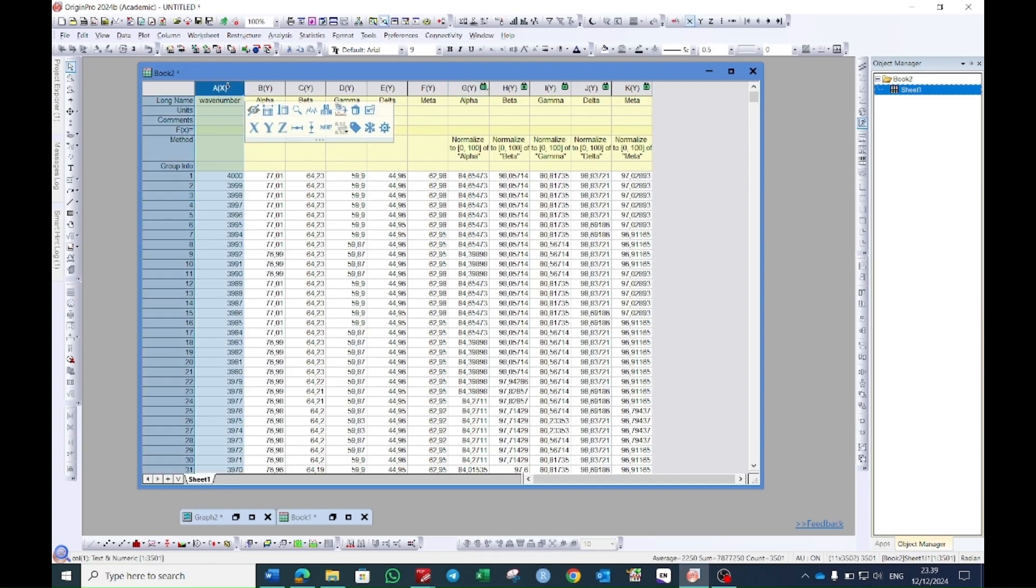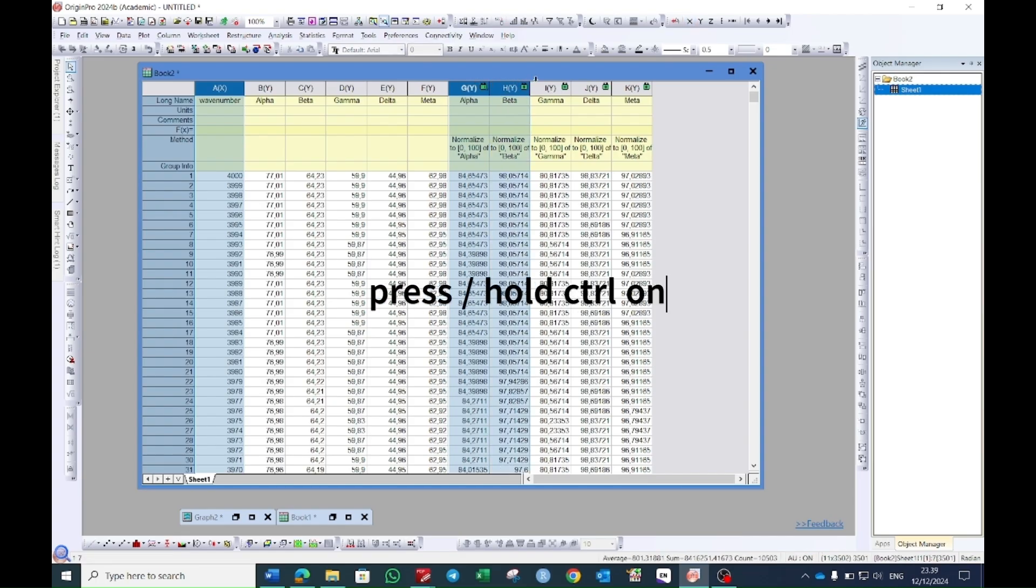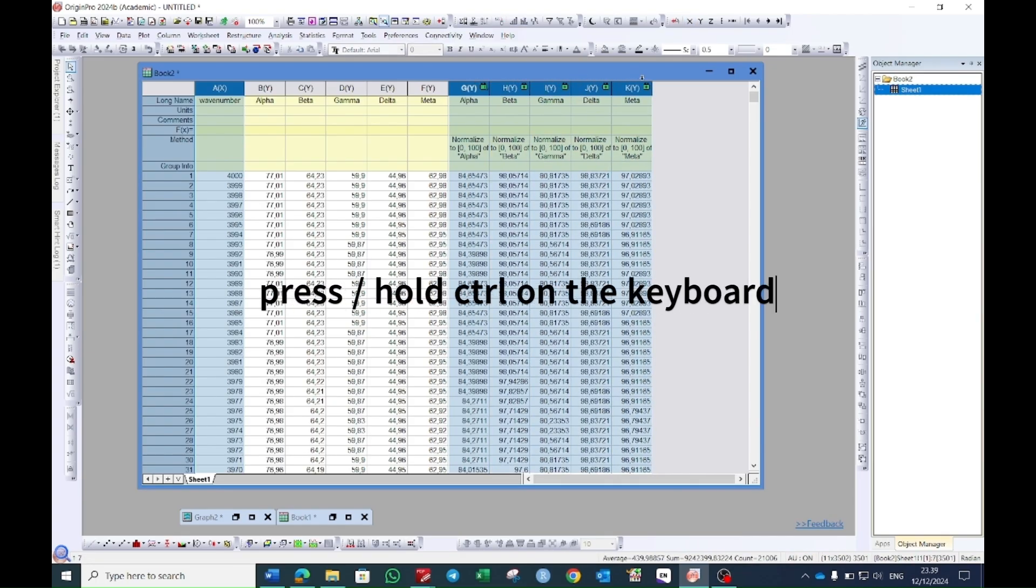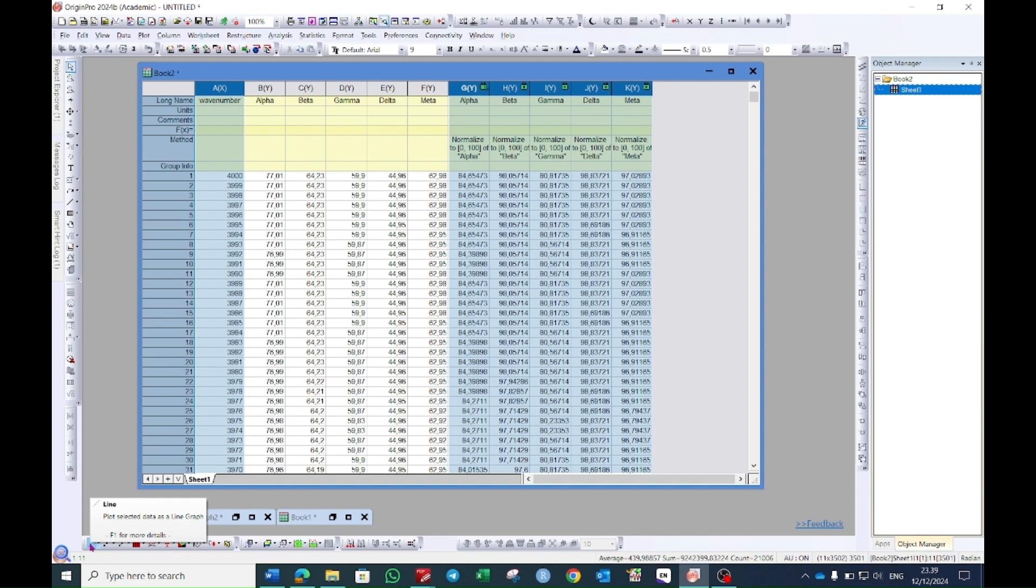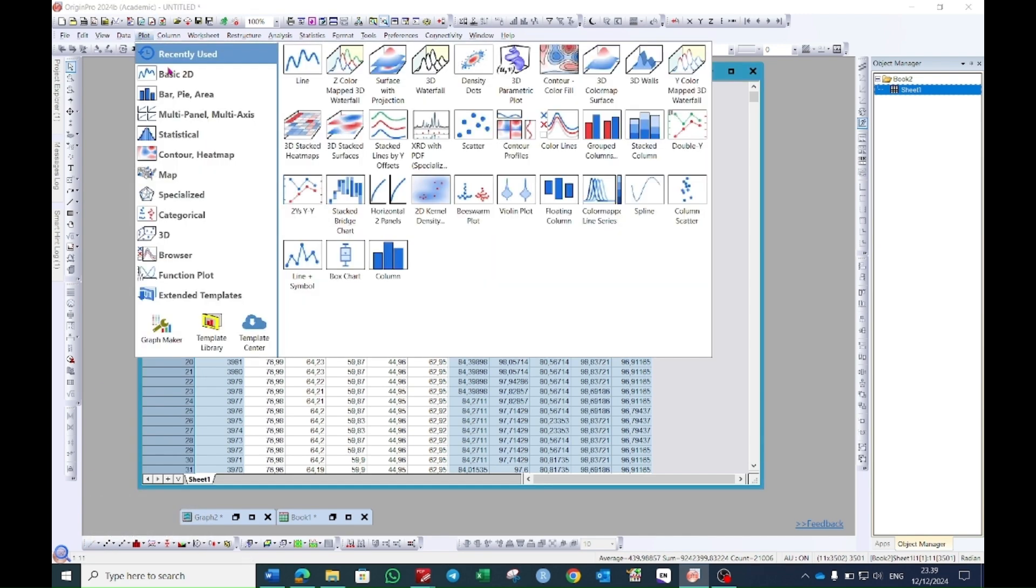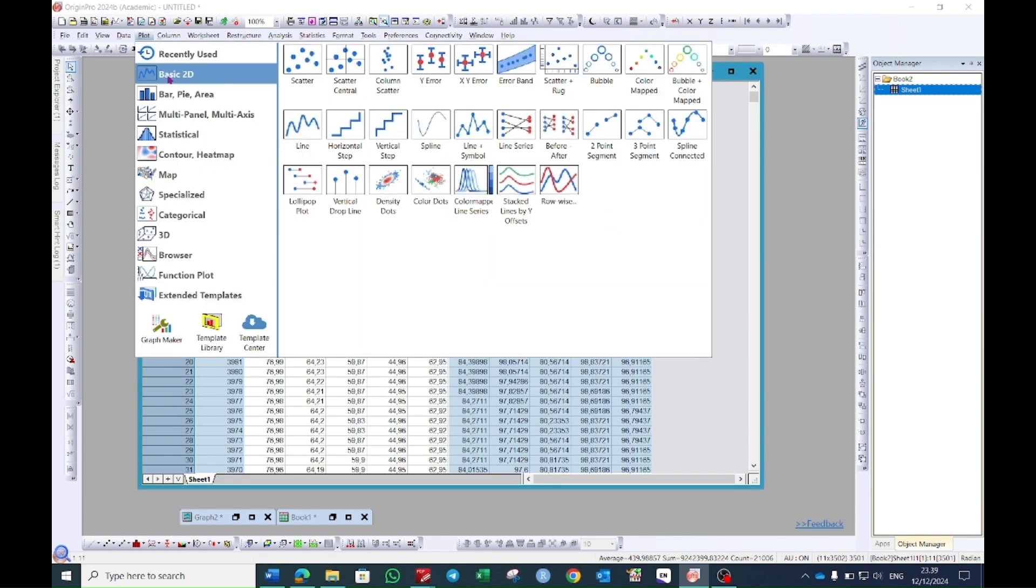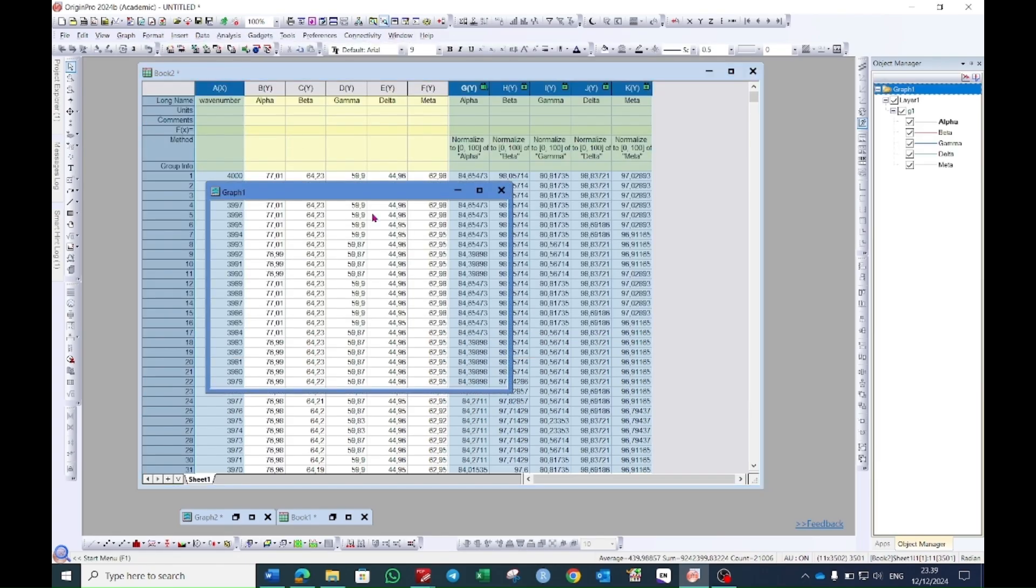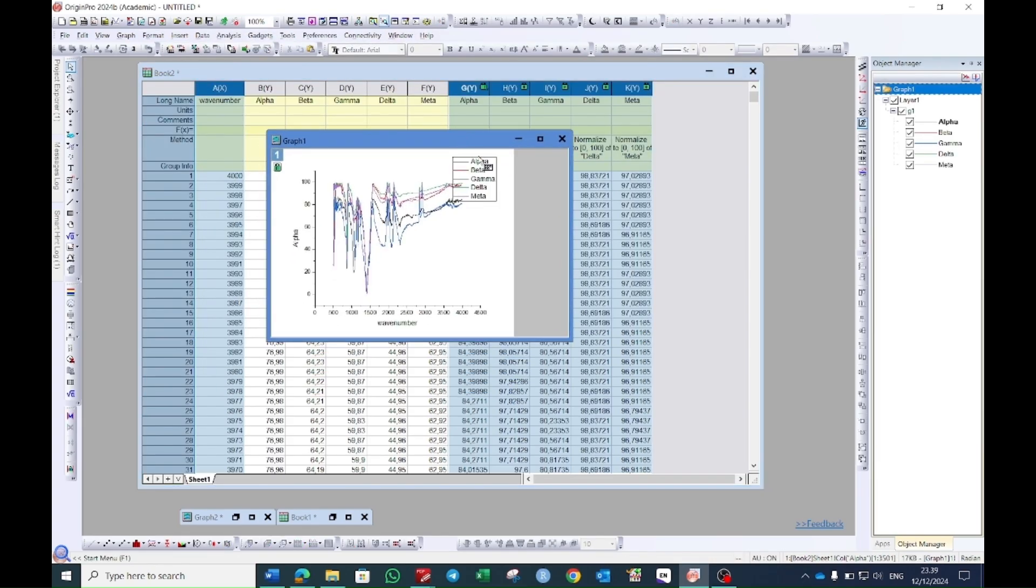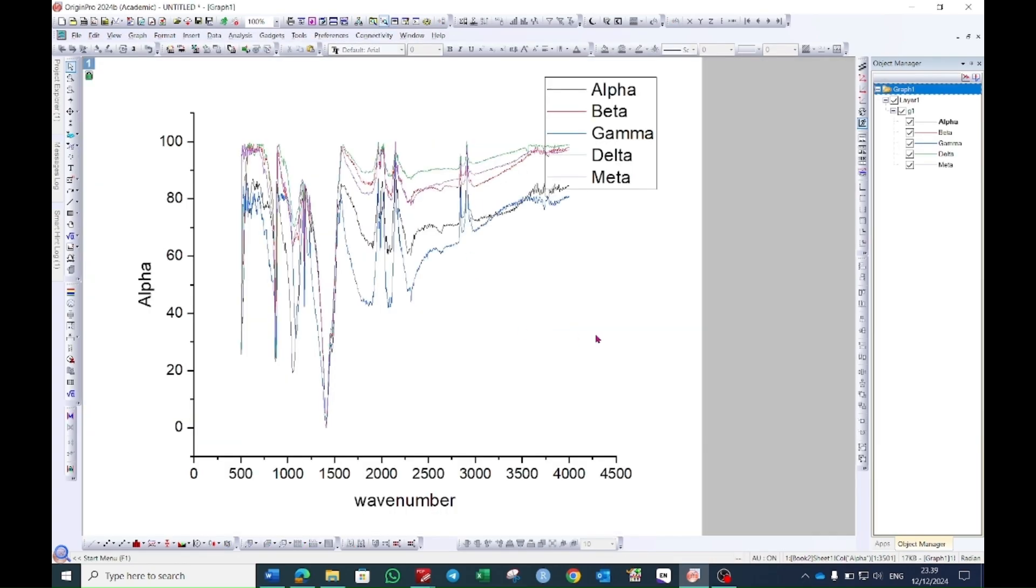Then select this wave number column and then press ctrl on the keyboard and select all of these normalized values. Then plot the graph. You can plot it either by selecting this line button here or going to the plot option and then going to the basic 2D where you will see this line graph. Select this and your graph will pop up.